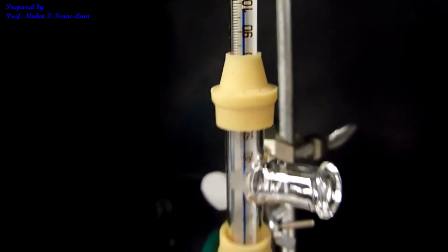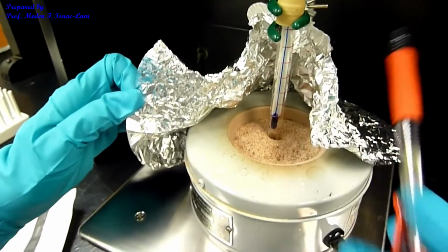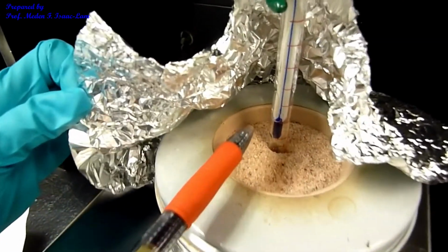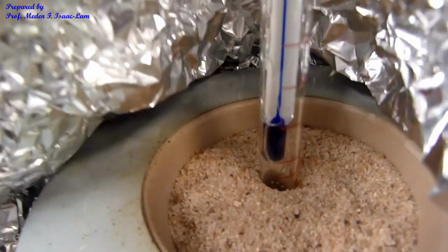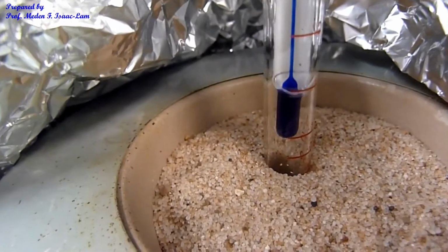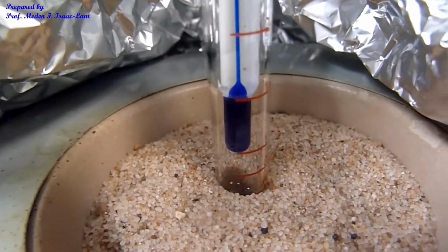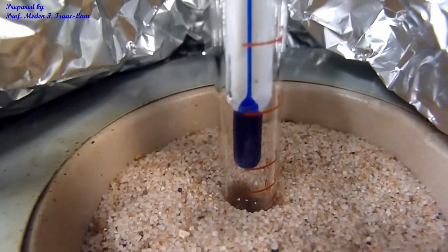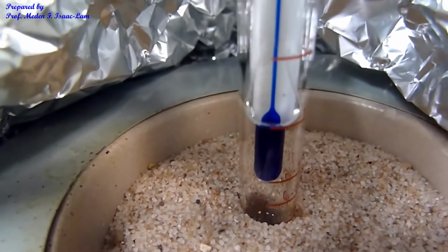And as you can see, the sample is actually refluxing. So you can see the reflux up. It's refluxing on the side, so it's evaporating and then going down into the solution, and so basically that's the boiling point of the sample.